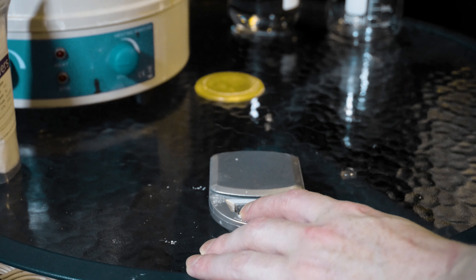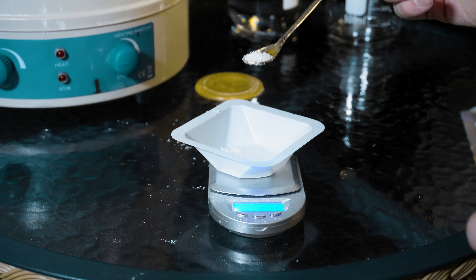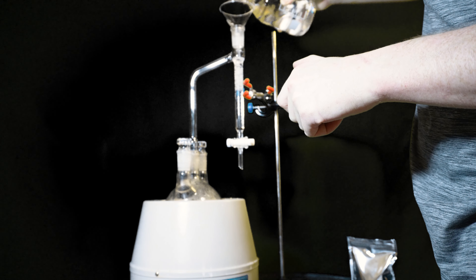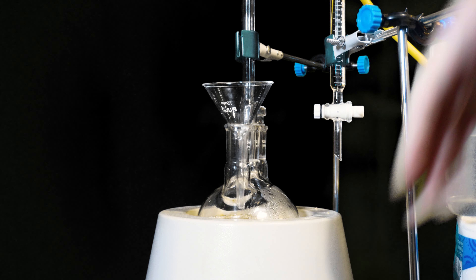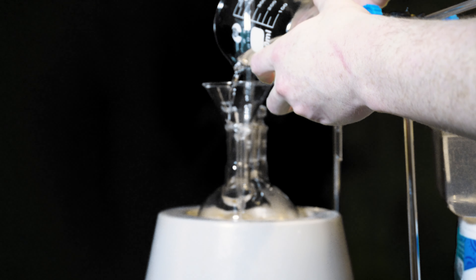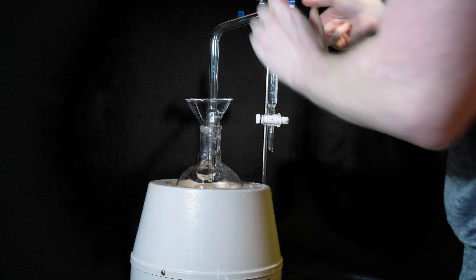Next I weigh out some PTSA — about a 0.1 molar equivalent to my cyclopentanone will do the job. After that I set up my Dean Stark and realize I have nothing to support it. I pre-filled the Dean Stark with about 20 mls of toluene, which I accounted for in my original measurement. I went to dry out just the PTSA and toluene first, but it wasn't really necessary, so I added the cyclopentanone in shortly after. This then went under reflux and can last anywhere between 18 and 30 hours — mine was either 24 or 26.